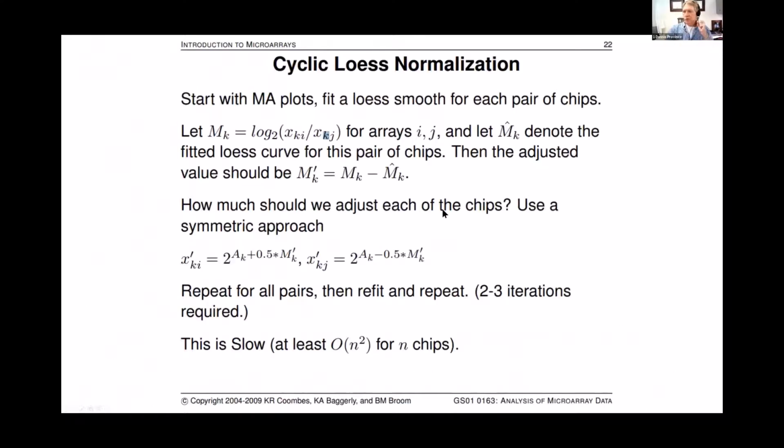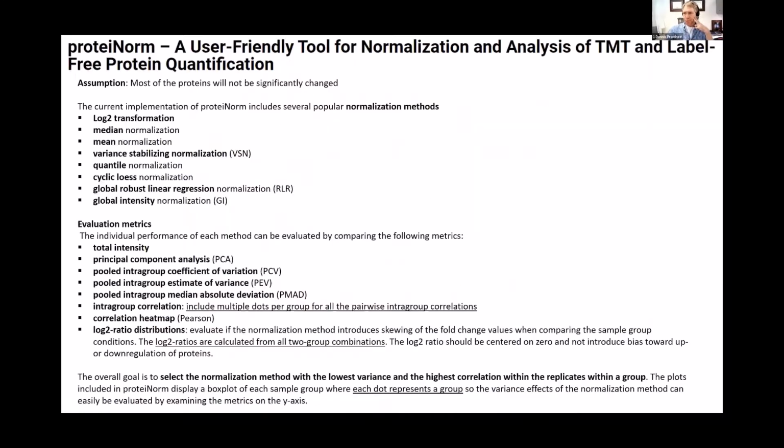Can you do more than 2 groups in Proteome? Yep, we do. I'm not sure if it'll do more than 3, because I had my postdoc develop it, and I had 3 groups, and we had to go in and change some of the algorithm in order to do 3. And then I think I broke it like 100 times before we got things to work. Always a work in progress.